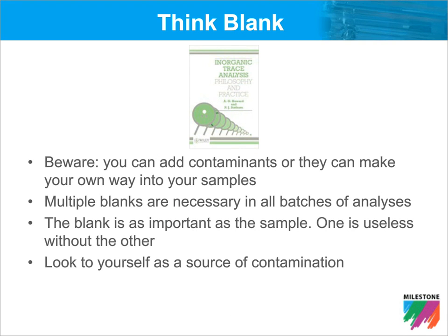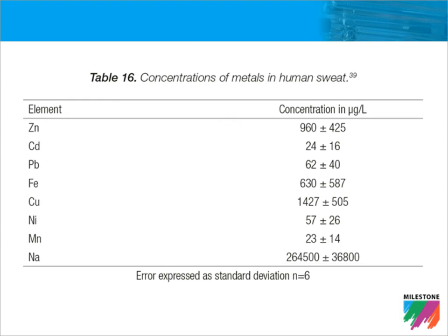A critical point in trace analysis is to think carefully about the analytical blank. We know that we can add contaminants in several steps of an analytical procedure. In trace analysis, it is always critical to remember that the blank is as important as the sample, and one is useless without the other. We need to look to ourselves as a source of contamination.